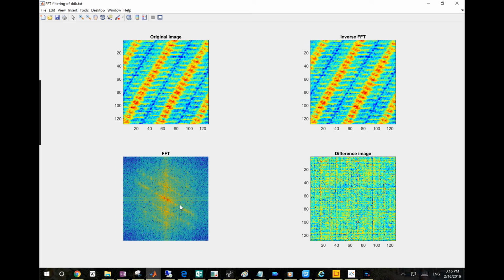And this is useful for averaging purposes. So once you remove those non-periodical information, you basically get the average value for your structures, because the structures are periodical, they can be averaged, and any information that's not periodical is not considered to be typical features of the structure. Most likely they're just artifacts, right?